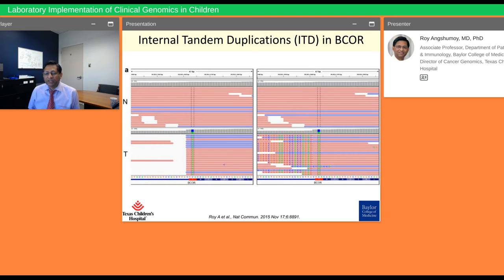And you can see on the left that exact same image that I showed you on the previous slide. However, if you can unclip those, so these are soft clipped, meaning these are hidden. If you can unmask these, you can see that all of these actually have some sequences after that were not showing up on the left. You can see on the right.